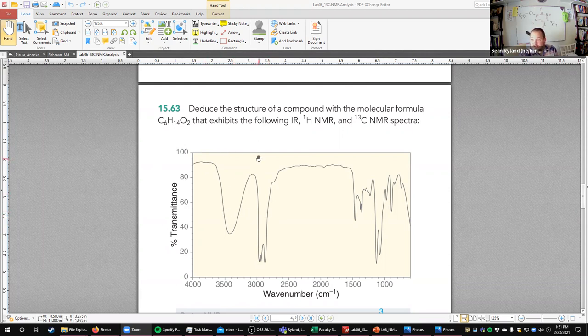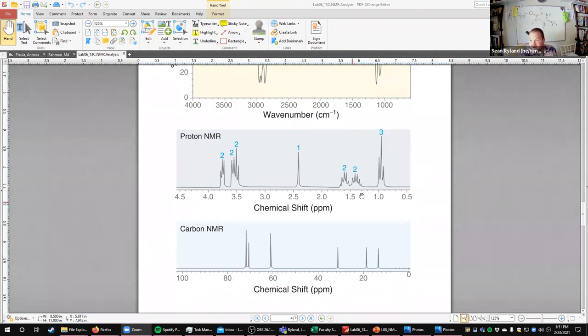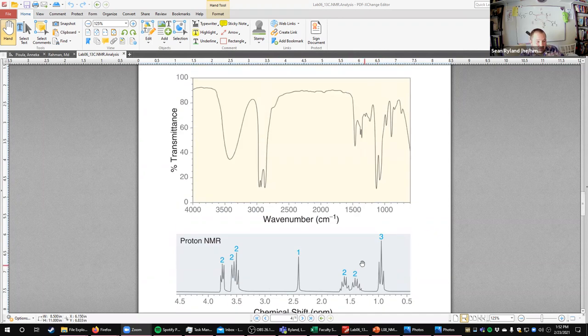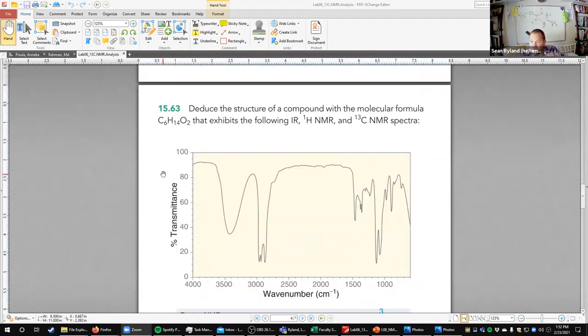So there are a lot of different ways you can arrange that still, and that's where the NMR is going to come in. Look at all the different types of signals we have here. And so figuring out, okay, where do I put a methyl versus not is going to really come into play here based on splitting and the integration. And the fact that we have 1, 2, 3, 4, 5, 6 different signals in the carbon NMR, and we only had 6 carbons total, right? So all of our carbons are going to be unique.